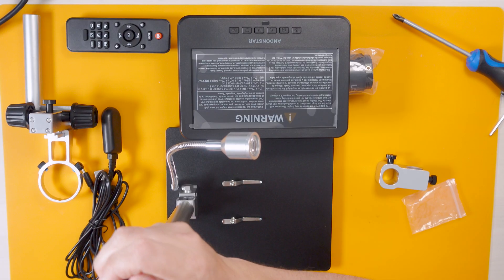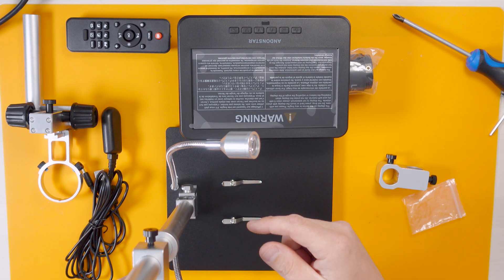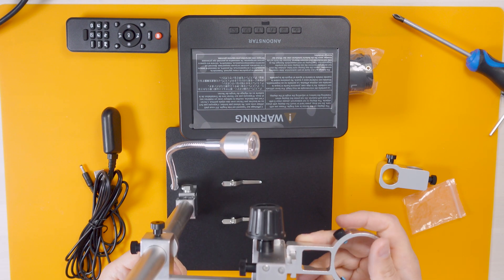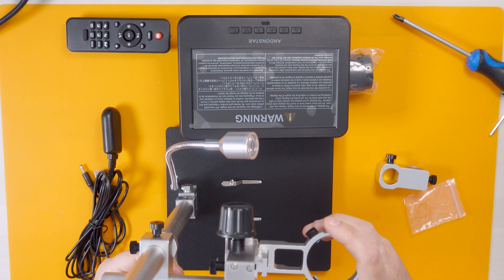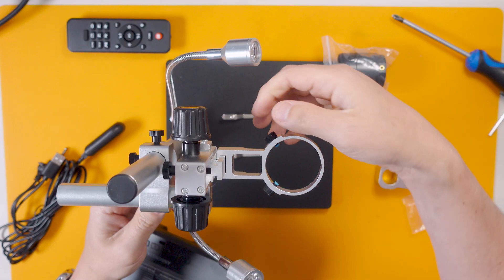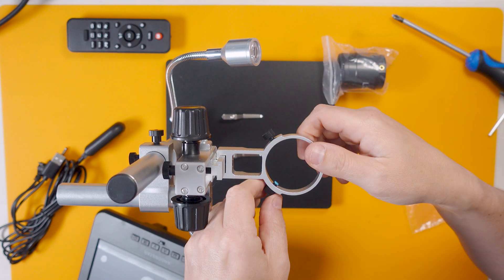Oh no, it doesn't fit... there we go! Look at that. So now we've got to unscrew these guys a little bit.